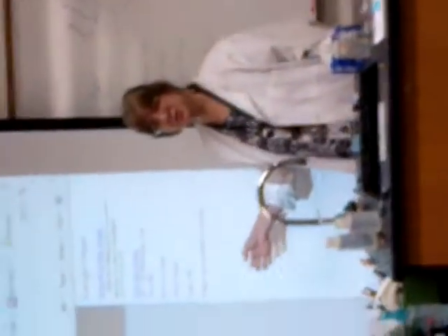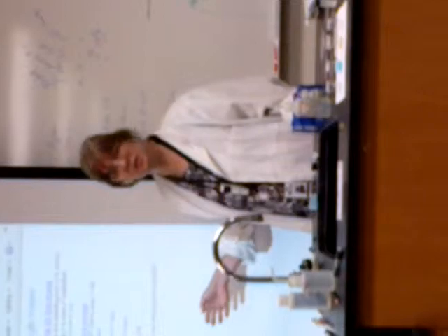This is a zone of inhibition. This is your antibiotic plate. You'll be measuring edge to edge, the entire diameter, or the radius times 2. Two of those are correct. How would you measure that zone of inhibition? The entire diameter or 2x the radius? 2x the radius.